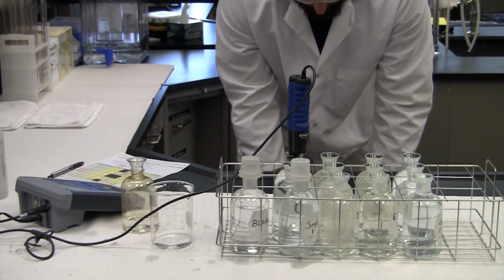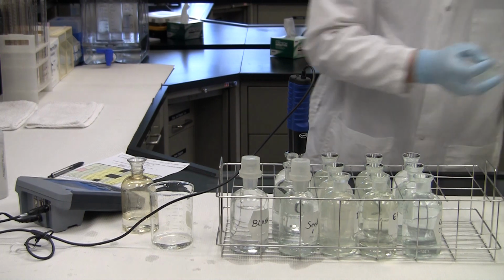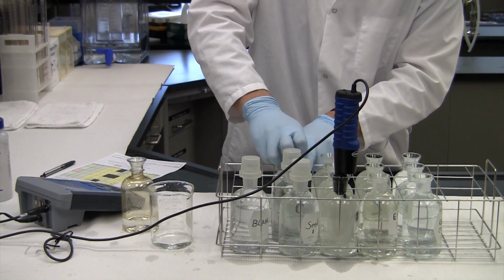Gently but firmly insert a glass stopper into the bottle and place the plastic cap securely on the top of the bottle. Do this for the remaining bottles. Make sure that you record the time of the readout on your bench sheet.